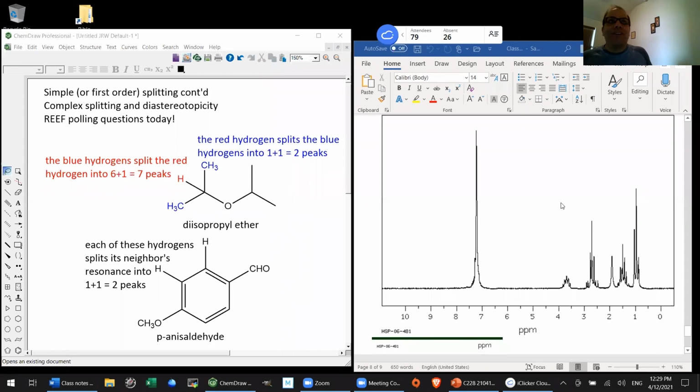What will happen in practice is I'll take a spectrum of some compound, and a proton spectrum, and it'll look just terrible. You know, it'll look like this. And I'll go, what on earth is going on here? I thought I purified this compound. You know, I thought I did a column chromatography or whatever, and it was extremely pure. And then all of a sudden, when I look more carefully at the structure, it'll just hit me. Oh, hell's bells, they're diastereotopic, and that's why it looks like that. So it's often something you figure out kind of after the fact. But it's something to stick in the back of your mind as a possibility, and Al will give you some practice in those as well, since now we can finally finish our chapter 13 owls.